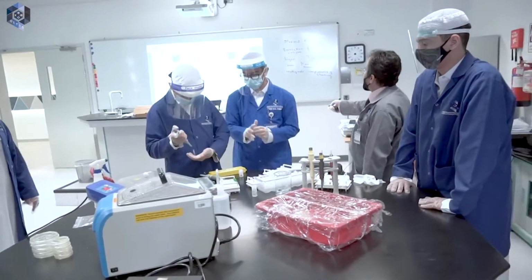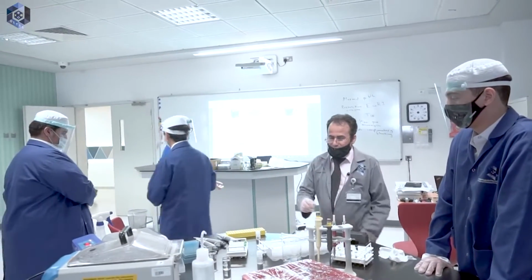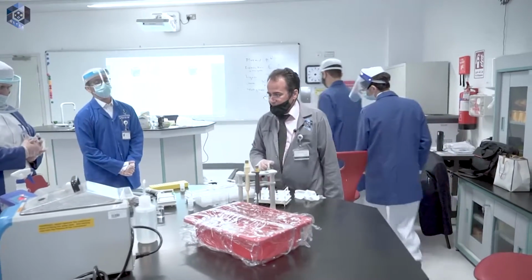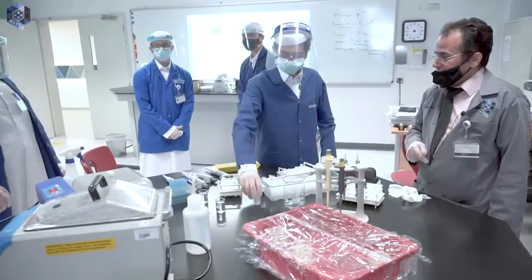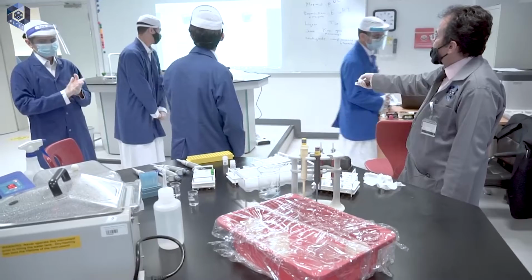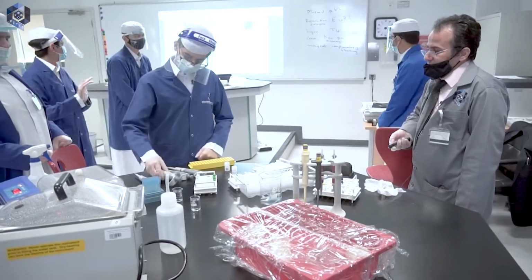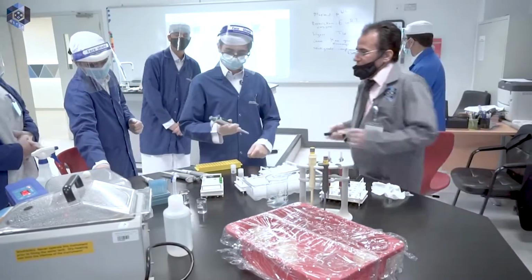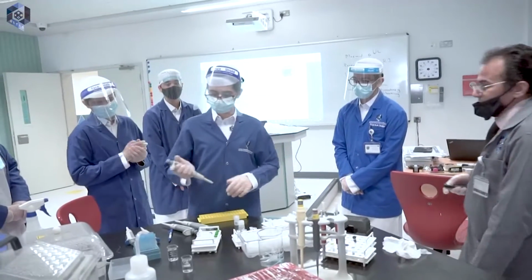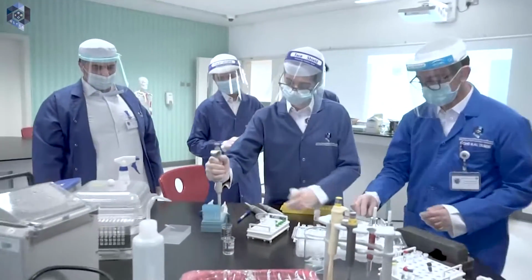Now, the next step, we will transfer 500 microliters of ice cold CaCl2. So, where is the CaCl2? Come, Imadi. Your turn. Take the CaCl2, the calcium chloride, and look at the procedure. What is the volume you are going to add? 500 microliters. So, which pipette is more suitable? Okay, good. Now you will be using the blue tips. Take 500 microliters of the calcium chloride and add to the green ones. Open the green bottles.